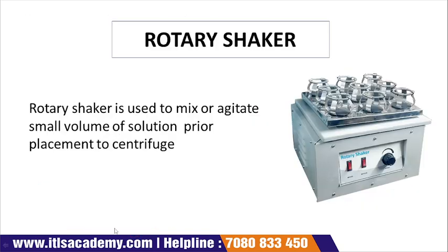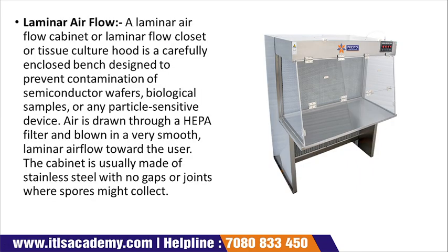Now next is your rotary shaker. Rotary shaker is a very simple device. It is used to mix or agitate a small volume of solution, and this solution is used further in a centrifuge.